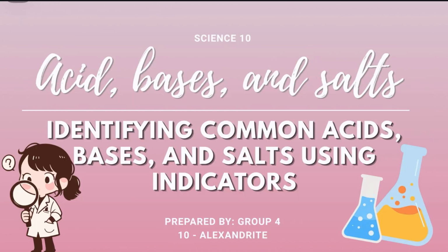And again, this is acids, bases, and salts, identifying common acids, bases, and salts using indicators.